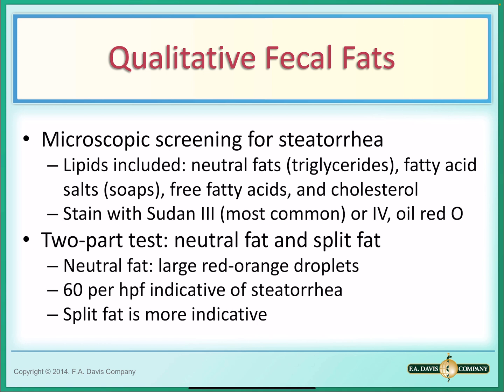The lipids included in the microscopic examination of the feces are neutral fats such as triglycerides, fatty acid salts, fatty acids, and cholesterol. Their presence can be observed microscopically by staining with the dye Sudan III, Sudan IV, or oil red O. Sudan III is the stain used more commonly.